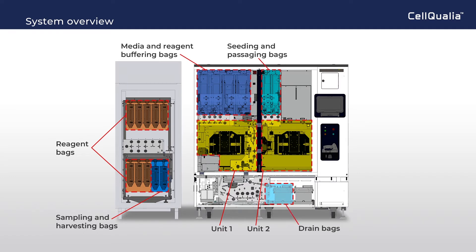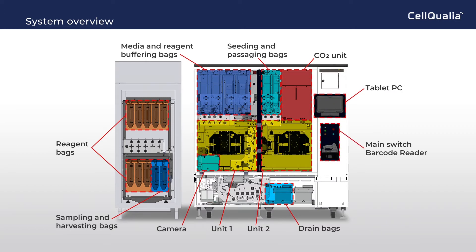Drain bags are located in the bottom, and the CO2 unit, camera, tablet PC for system control, and main switch and barcode reader are as shown.